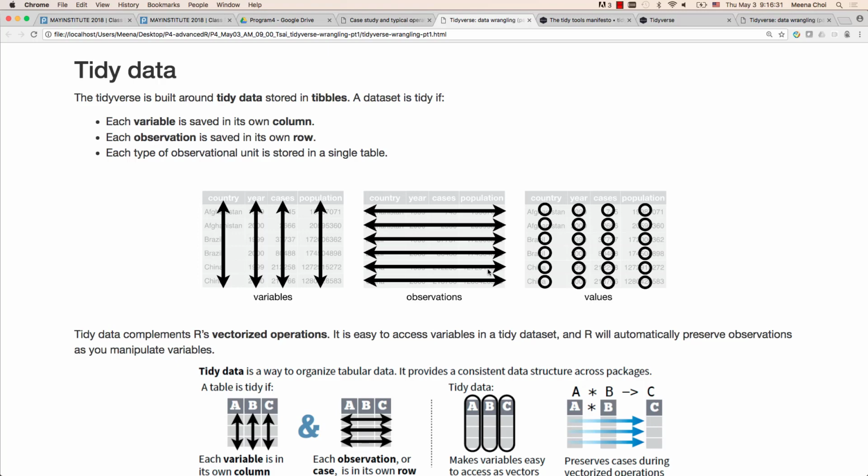Say, for example, in our data set, our basic unit is essentially the integrated peak intensity from LCMS data. So you don't want to mix up this type of basic unit with, say, other measurements like temperature or height, that kind of thing.